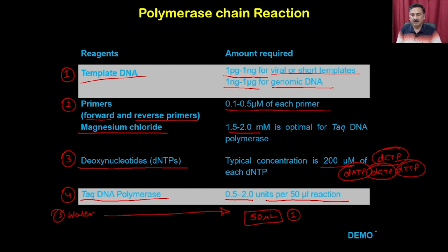So we have prepared a small demo to demonstrate these events. This demo has been prepared in my laboratory by some of the students, and they are going to show you how to set up the PCR reactions and how you can perform the PCR.